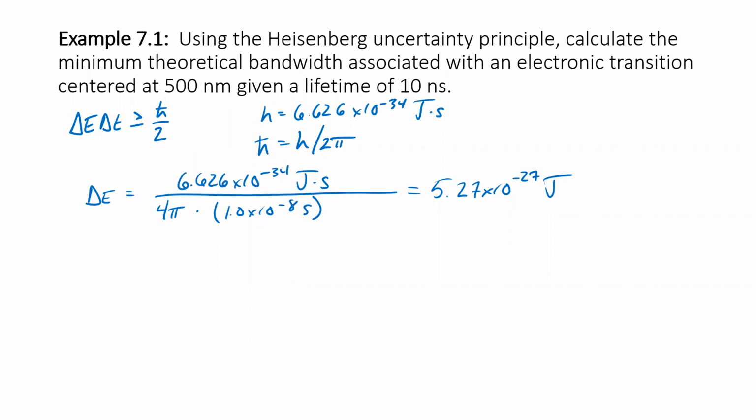Okay. So we're going to take this energy difference and apply it to the wave equation, so that we get our bandwidth out. And remember that E equals h nu equals hc over lambda.